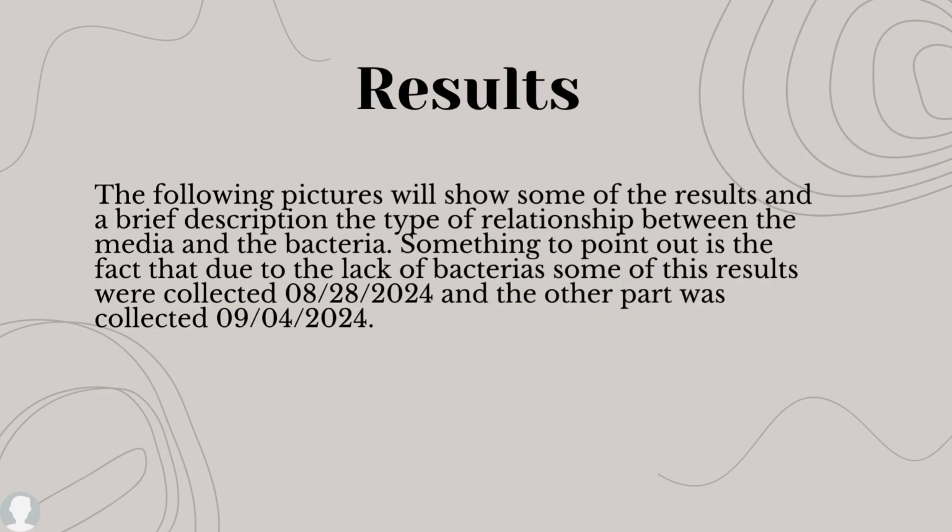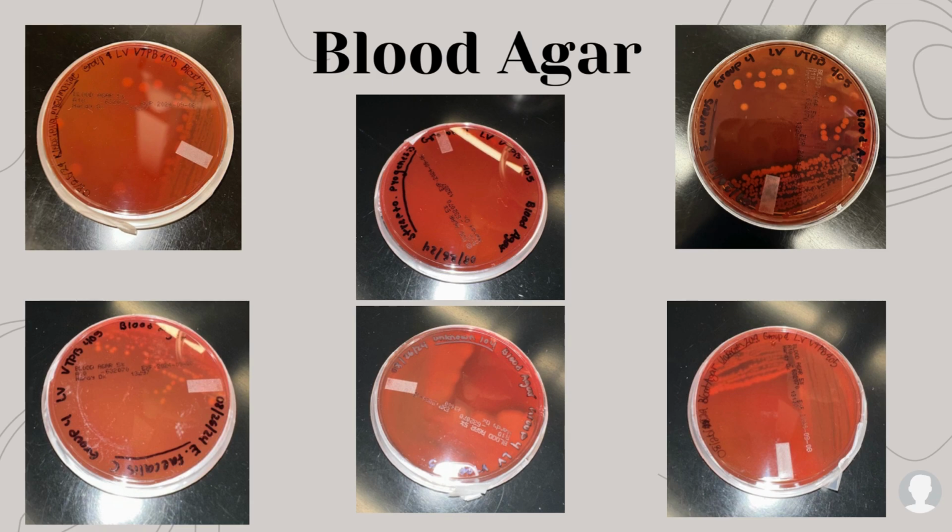In the following slides, we will show pictures of our results and will provide a brief description of the type of relationship between the media and the bacteria. These were our results for the blood agar plate.